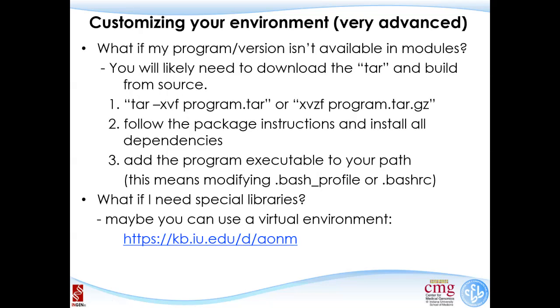So those are two basic ways that you can get Unix to do what you want to do. But there's a lot of tools on here that you won't be able to just load from UITS's repository and that no one else is using. Specifically, if you're like our laboratory and you're making your own tools, or your project has something to do with writing a new program, you might want to be able to link it to your profile.